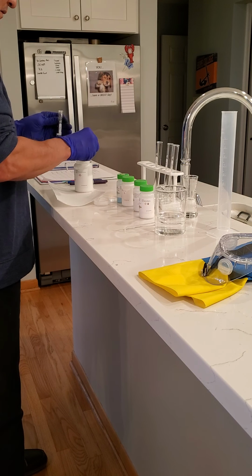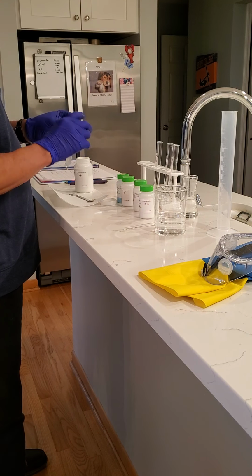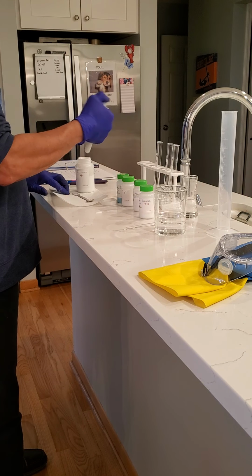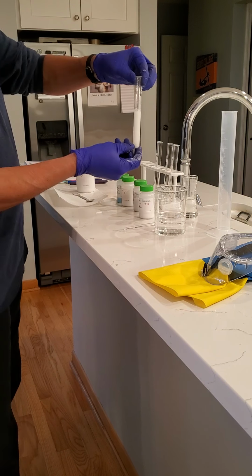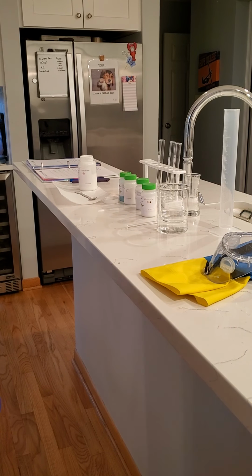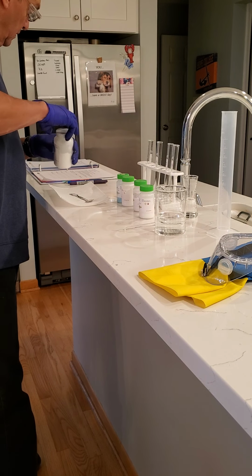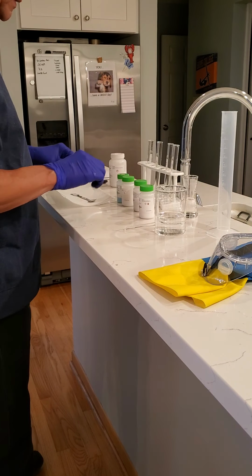Okay, so add a little bit of calcium hydroxide to the test tube, and then with our gloves on, we're going to hold our thumb over the top, we're going to invert, and we're going to shake. And then we're going to make our observations in terms of solubility for the calcium hydroxide. This is what the calcium hydroxide test tube looks like after first shaking it. And then we're going to let it sit for a few minutes and record our observations over time for each of these. Okay, so that's the calcium hydroxide. Let it sit for several minutes and then shake it again and make some more observations. So this is going to take a little bit of time.